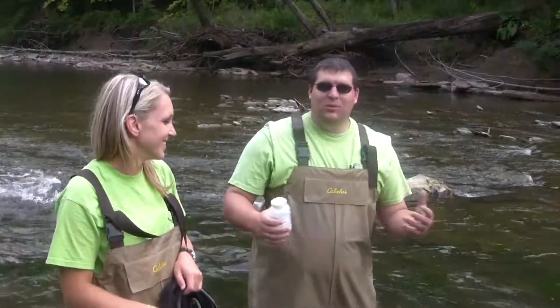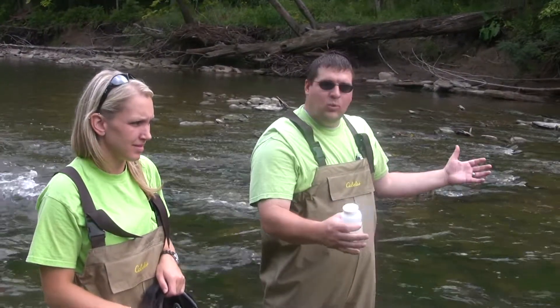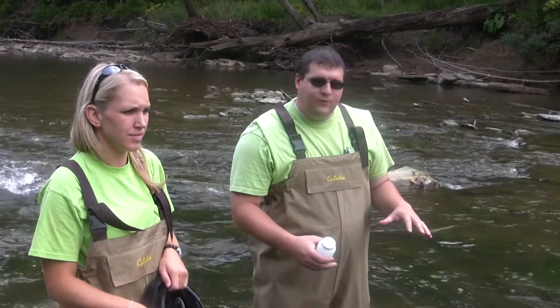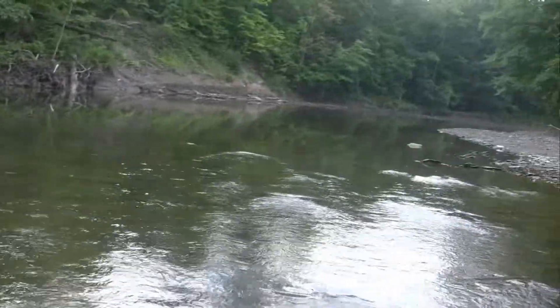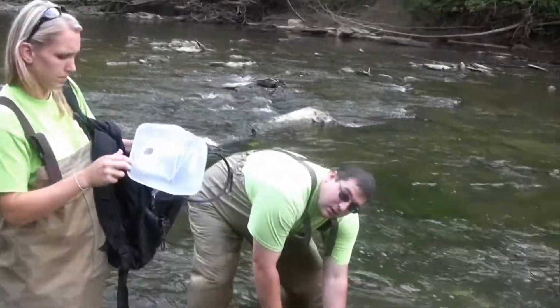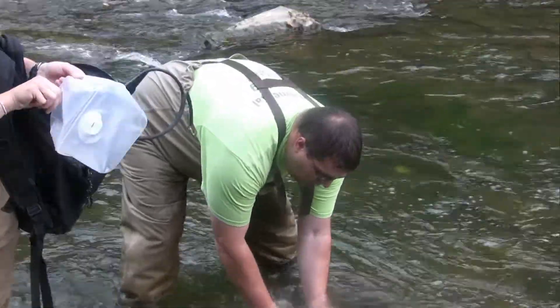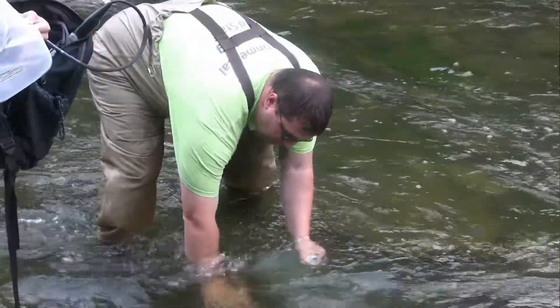When we go to take a sample in a river, we want somewhere in the middle, somewhere with good flow. That way we get a good representative sample of the water chemistry of the water that's coming down the stream.